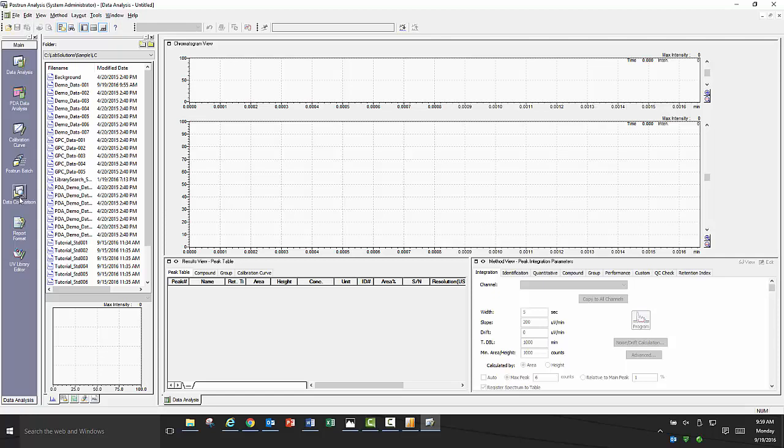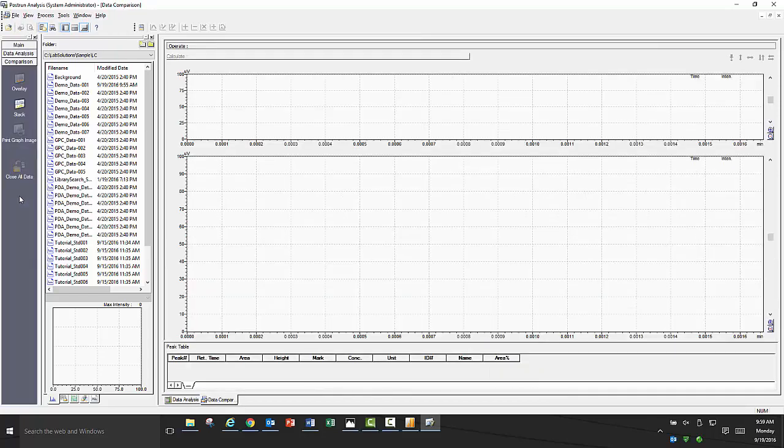As a starting point for most beginning users, we often direct them to data comparison to look at differences in chromatography between runs. To start data comparison, click on the data comparison icon in the assistant bar on the left. Once it's opened, you will see the file explorer window immediately to the right of the assistant bar.